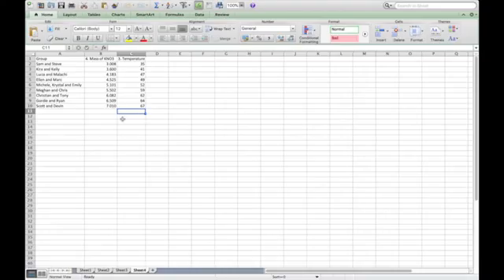So feel free to take any of these samples, any of these examples here. Also note I've only written down the mass of potassium nitrate and the temperature. So again, you don't need the mass of the container or the mass of the container with potassium nitrate, just the mass of potassium nitrate. And remember, this is the grams of potassium nitrate in 5 milliliters of water. You need to scale it up, figure out what the solubility is, and accordingly plot that.